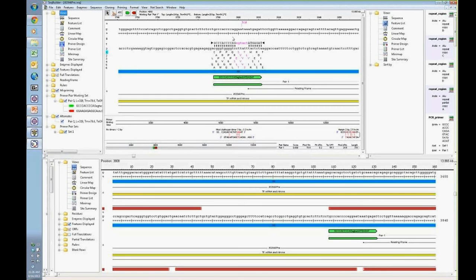Hi, Brian. We do have one question before we go along to discuss cloning. That question would be, so you've created this primer. Can you use the same primer then in other DNASTAR applications? Thank you, Jackie. Yeah. So when you export these primer pairs or sets that you're working on, one of those options is the primer catalog.